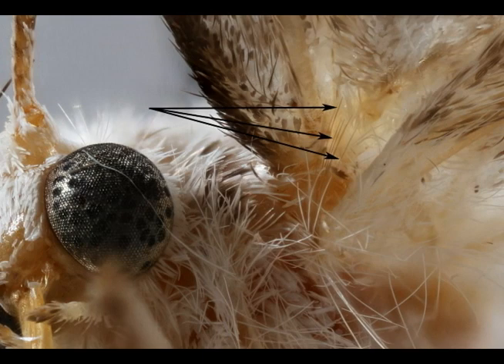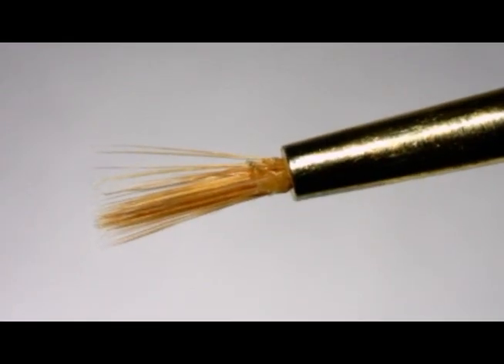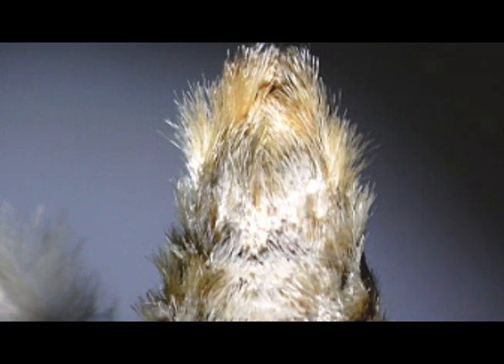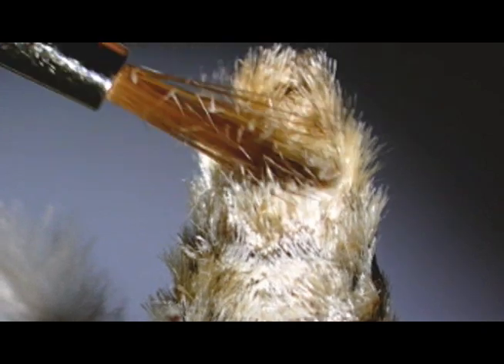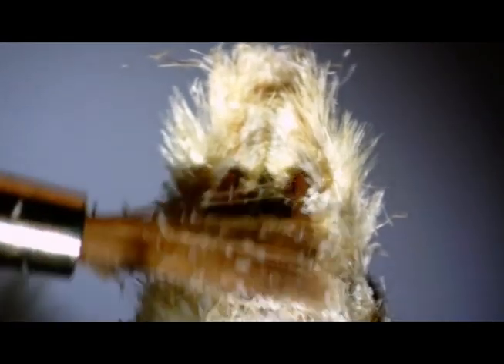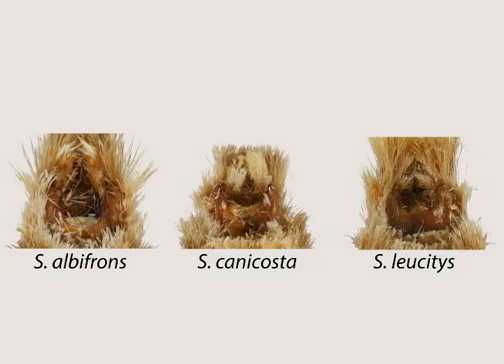Females will have two or more of these bristles. Now that we've confirmed that this one's a male, I take a small but firm brush to gently brush away scales to observe the shape of the eighth sternite. A small paintbrush like this one works well for this purpose. It may be slow initially, but eventually scales will fall off and you will see one of three distinct U-shaped structures.